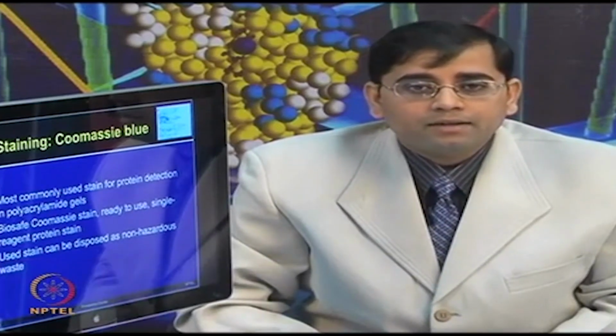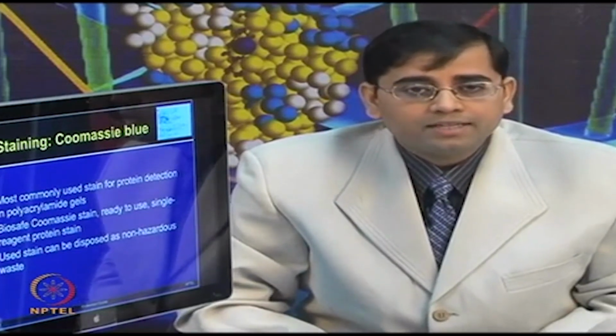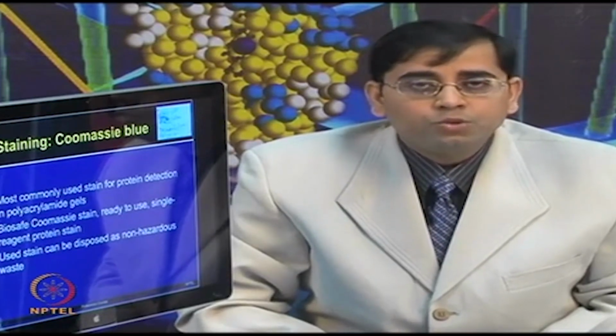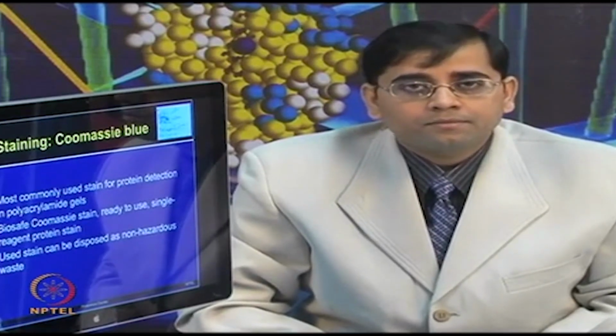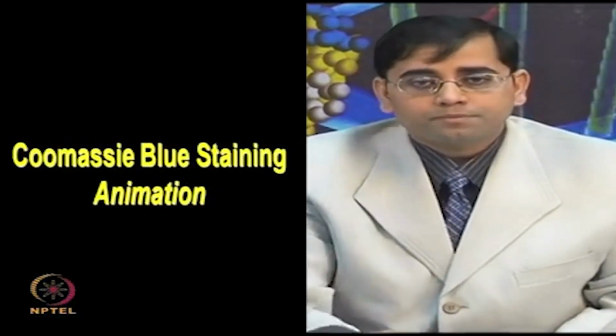Now, there are some advanced forms of Coomassie stains being developed, including BioSafe Coomassie stain, which is non-hazardous, made keeping in mind the environmental scenario. So, it can be disposed of as non-hazardous waste. The BioSafe Coomassie is also a ready to use stain and a single reagent protein stain. So, I will show you one animation of how to perform the Coomassie blue staining.